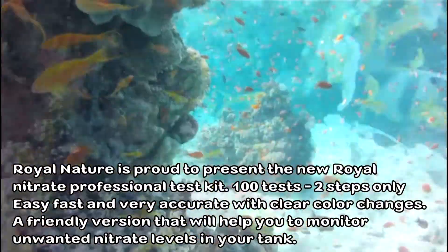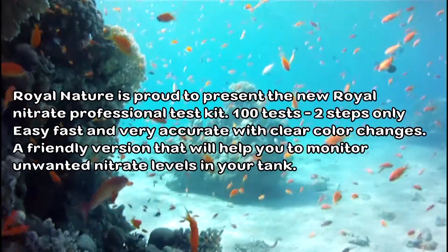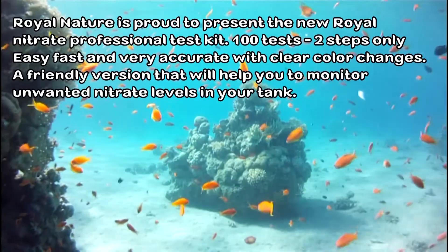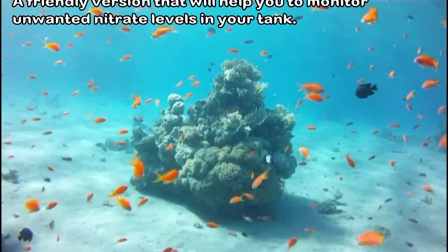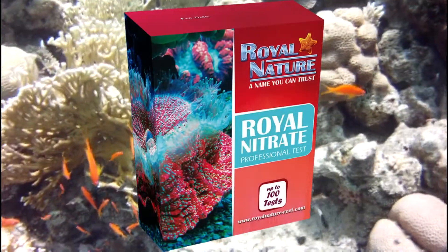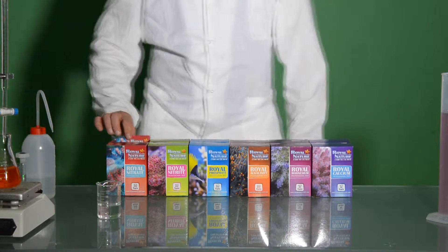Here we go. Royal Nitrate Professional Test Kit.